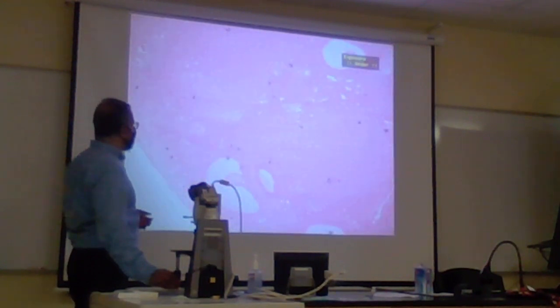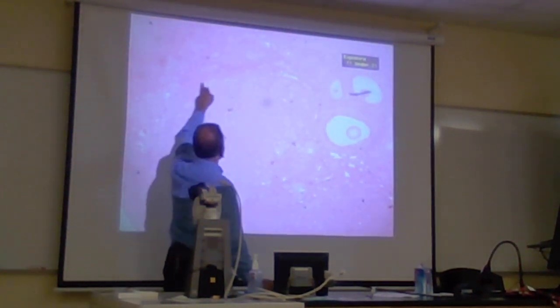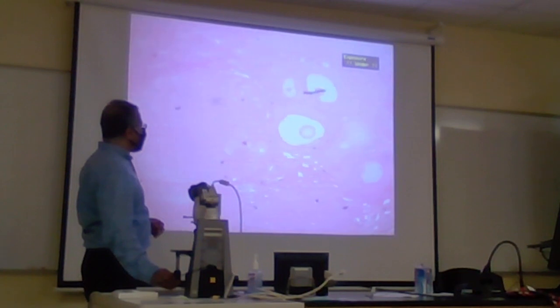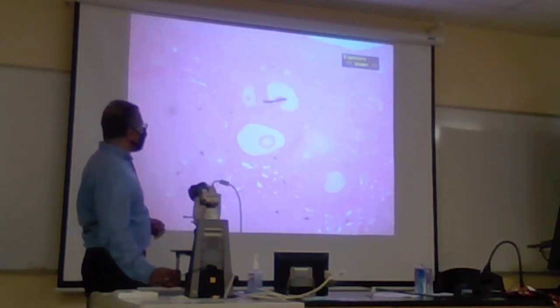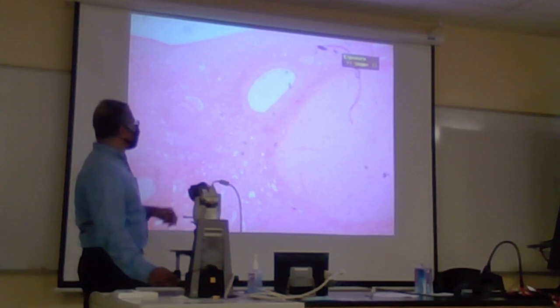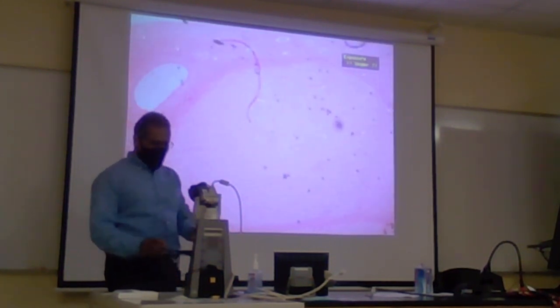So, this is different. This is the corpus luteum, this whole thing. These massive structures fill up nearly the entire ovary at times. And that's the follicle. So you can see different follicles in here. Also, corpus luteum. That's corpus luteum. That's how the ovary would look.